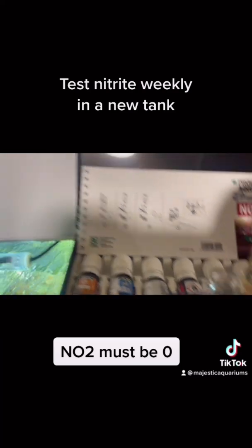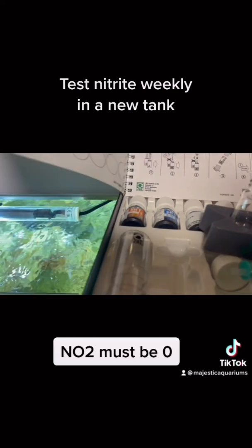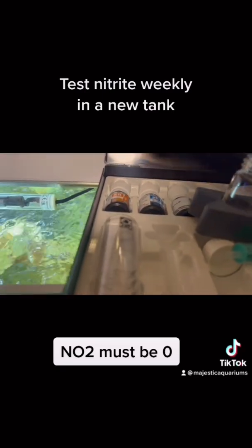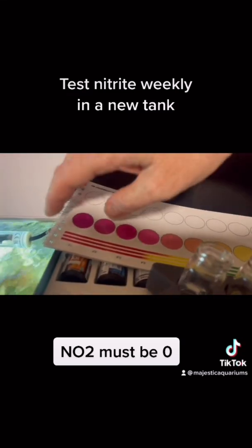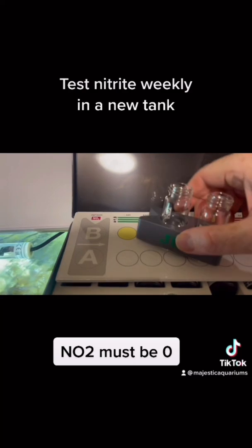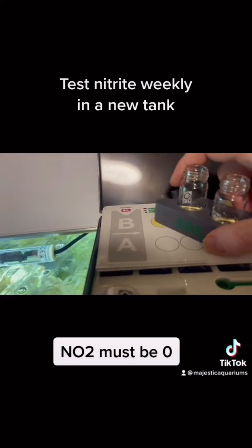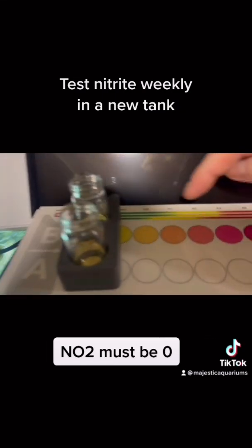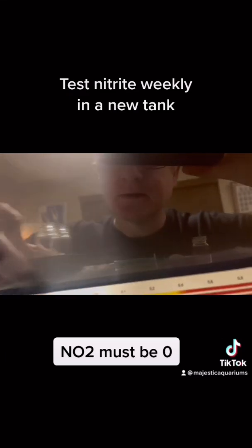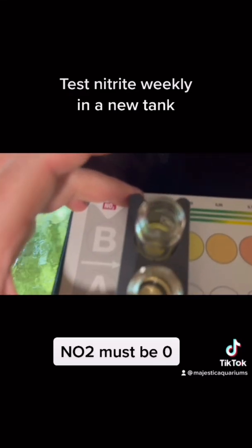I'll give it a little shaky shake. Then we're going to wait our 5 minutes. Then we're going to flip this over, put that down. Then we are going to get our little JBL viewer thing. Then we're going to go like this. Now this one is the control and this one is the actual test.